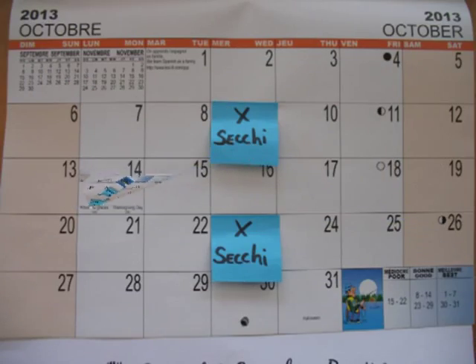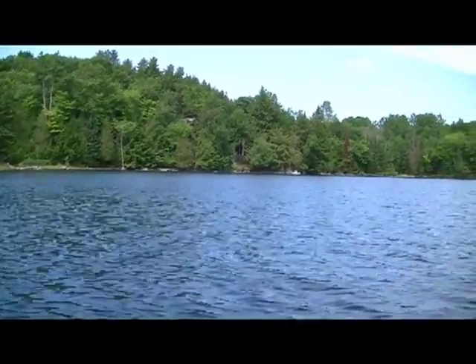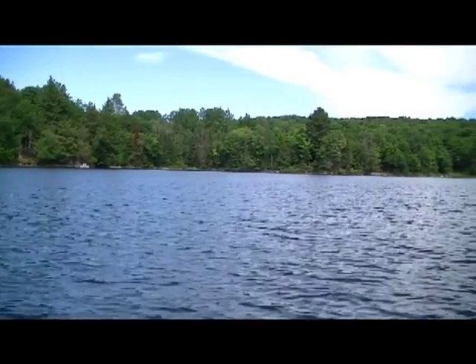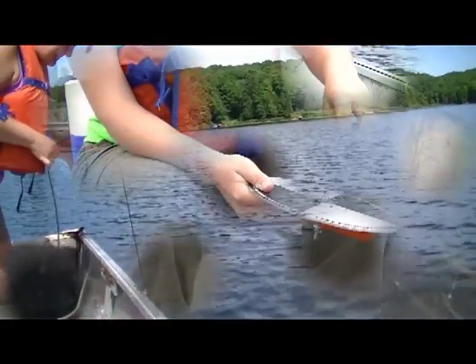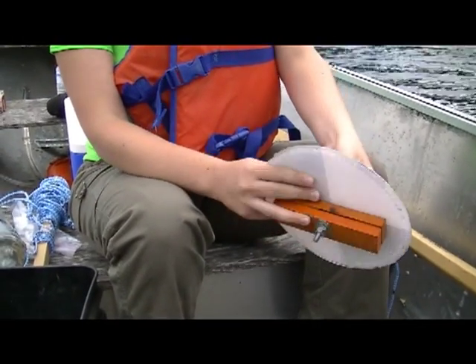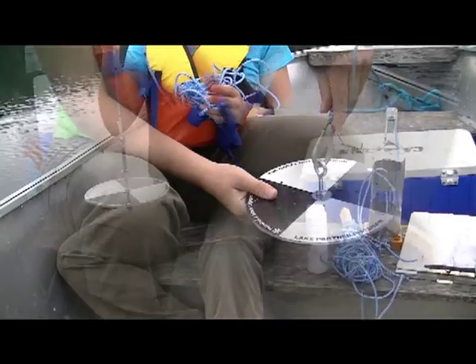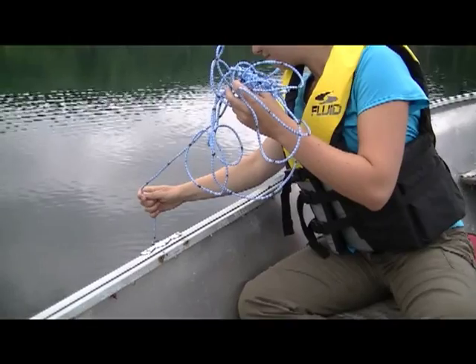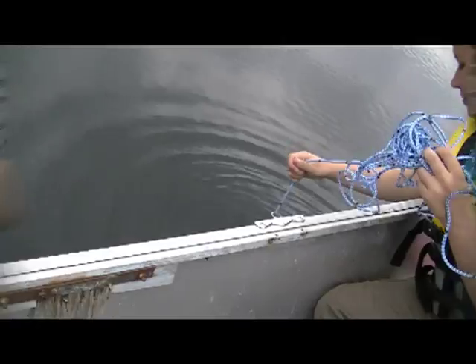Measuring water clarity happens at the depth where the visibility of your Secchi disc disappears and reappears. Once you've reached your usual sampling site by boat, it's important to anchor your boat to stabilize it and keep it in the same place while you are taking the water samples. Your Secchi disc should be equipped with weights so it can easily descend straight down into the water. A rope with graduated markers every 10 centimeters or four inches will facilitate your water quality readings, but you can achieve the same result by using clothespins.